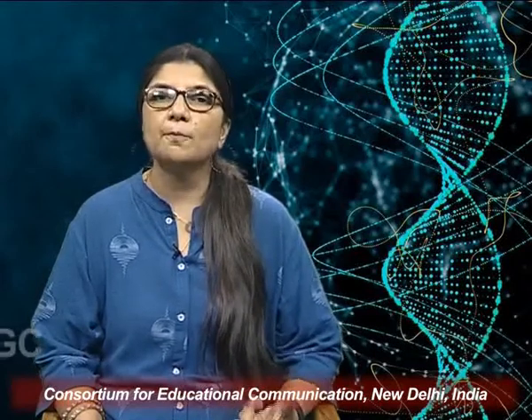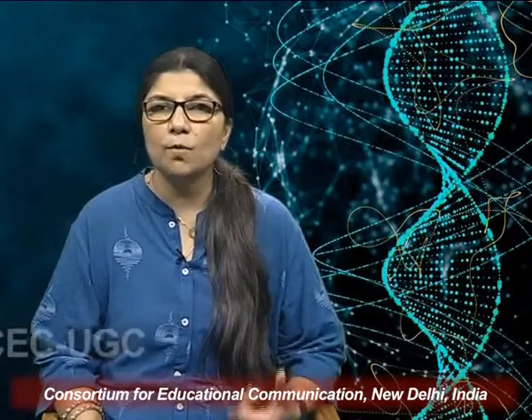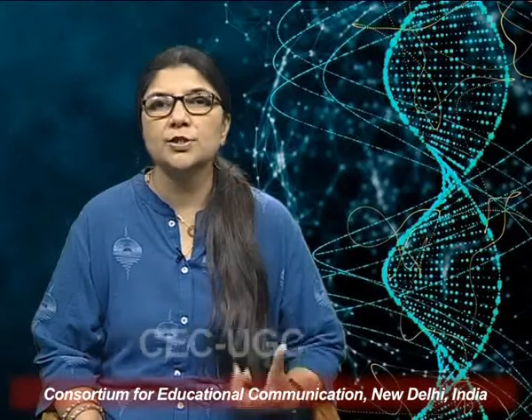So we can amplify from RNA, although we will have an extra step to convert it into a DNA molecule. We will talk in detail subsequently later in the session. But we require that template from which we need to amplify, identify or detect the gene of interest. That is basically the DNA template that we need to have.